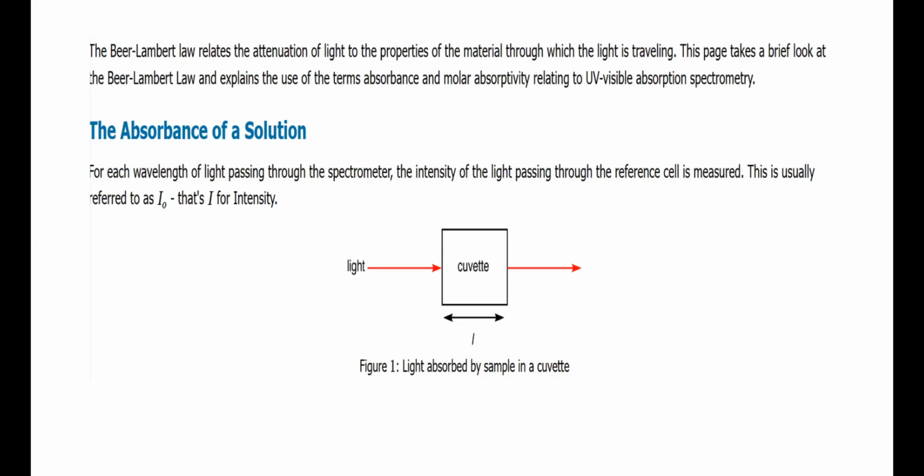That means if I start with the experiment that in this cuvette I have kept simple water, to that simple water I have just checked how much light it is absorbing and how much light is transmitted. Then I add some amount of soil into it, shake it, and make the suspension. Or you can take a bacterial suspension also, not necessarily soil suspension.